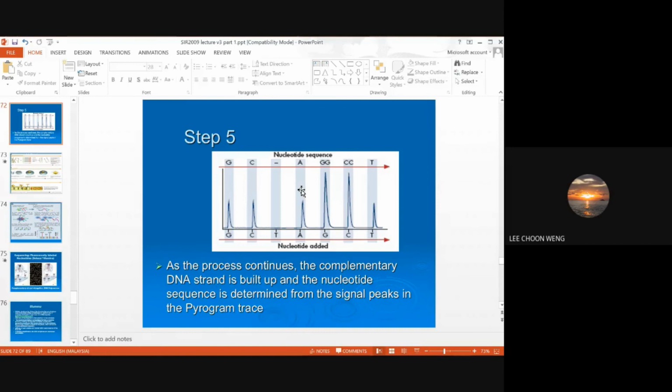Okay, so it also doesn't work well. It also uses a lot of consumables.